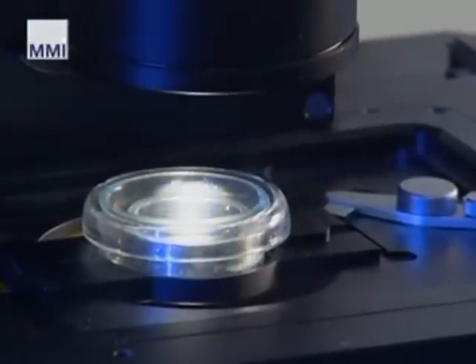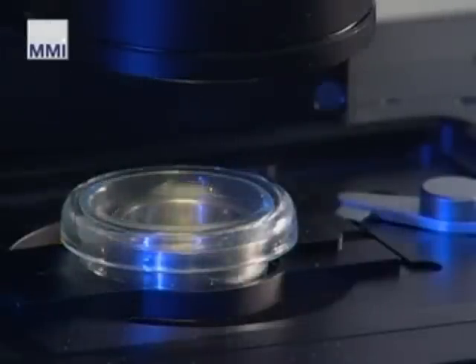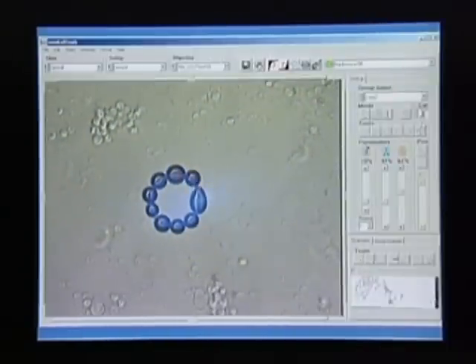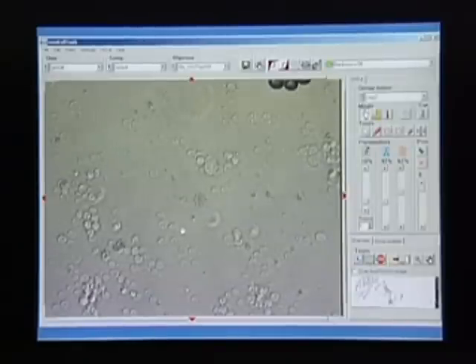All following procedures are done in the closed culture dish, which prevents contamination. Once the targeted cells have been identified, encircle them using a computer mouse or a digital pen screen, then just click on the cut button to start the automatic cutting procedure.